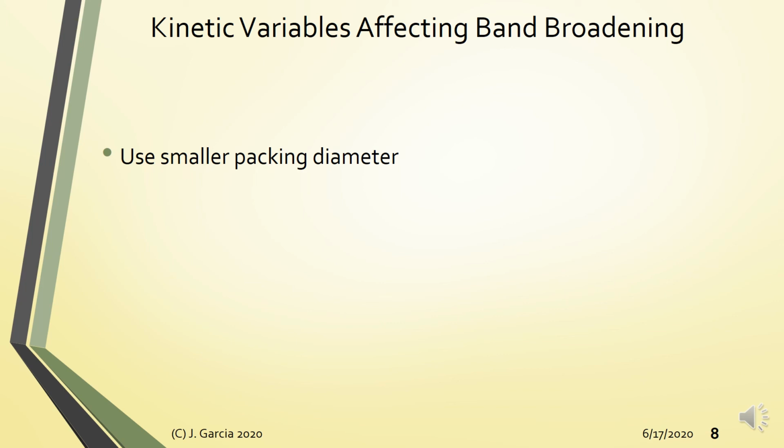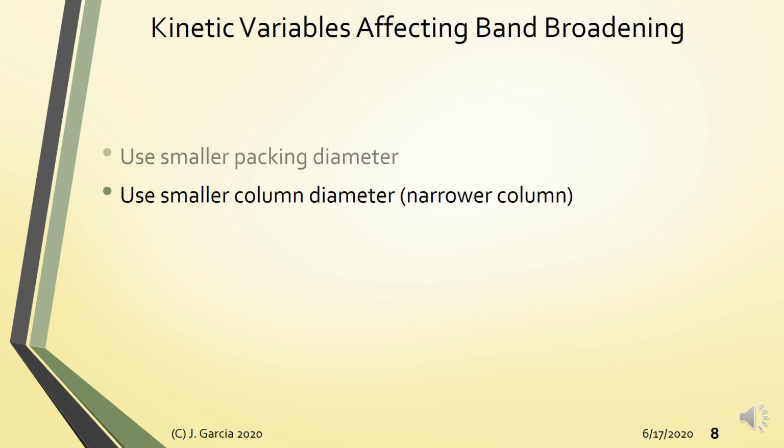So yung mga dating nirarun sa conventional HPLC that will take say 10 minutes, no, per sample. Sa UPLC it will only take around 2 to 3 minutes, no? So you have a reduction by a factor of 5 halos, no, dun sa iyong total runtime, and that will actually improve, no, yung number of you will have greater number of samples, no, that you can run, no, in your system.